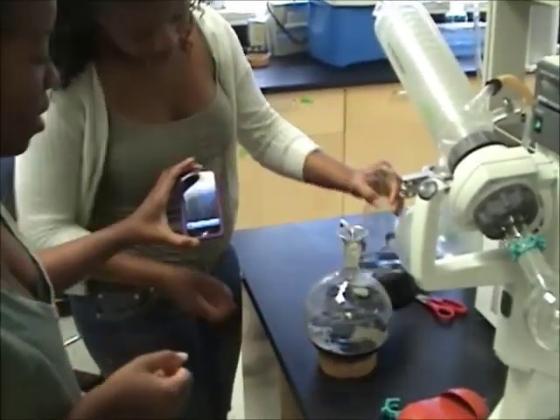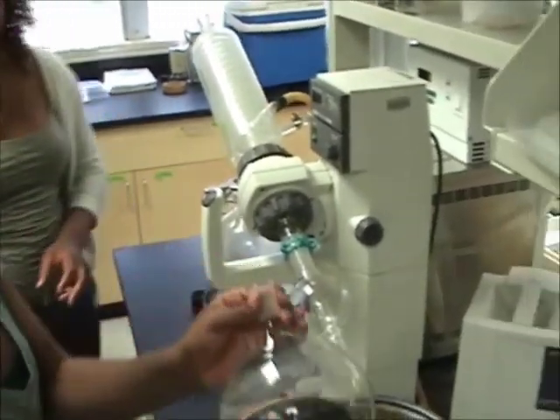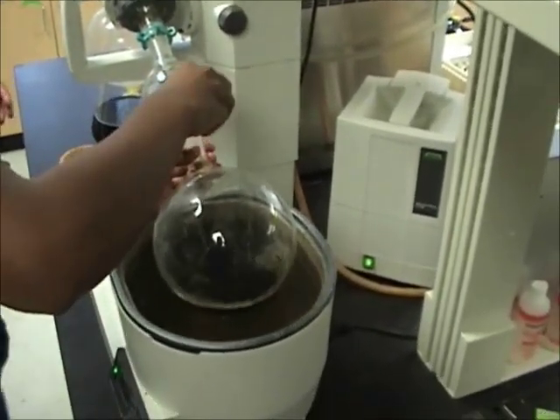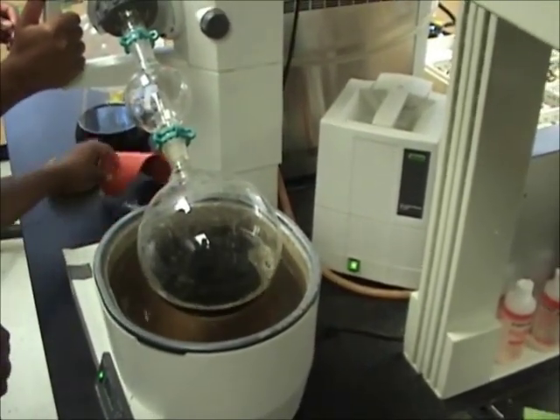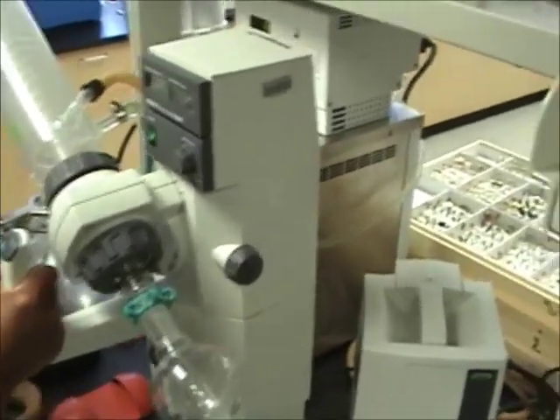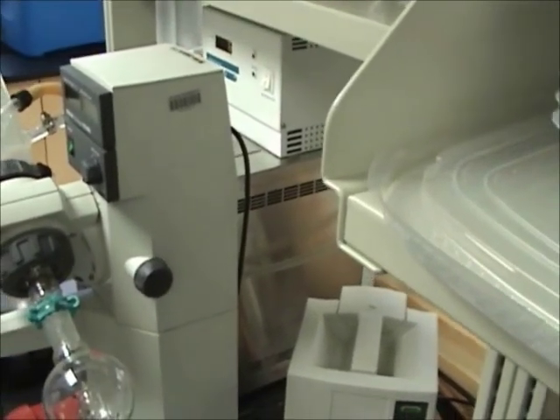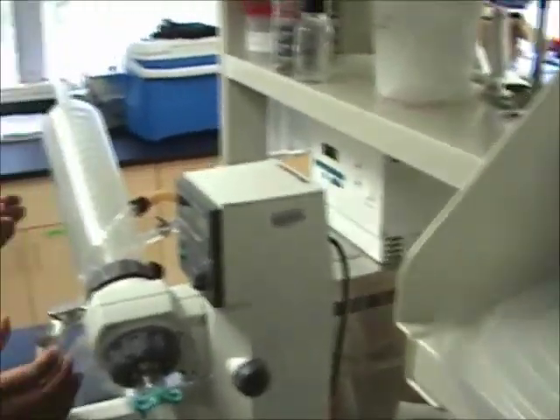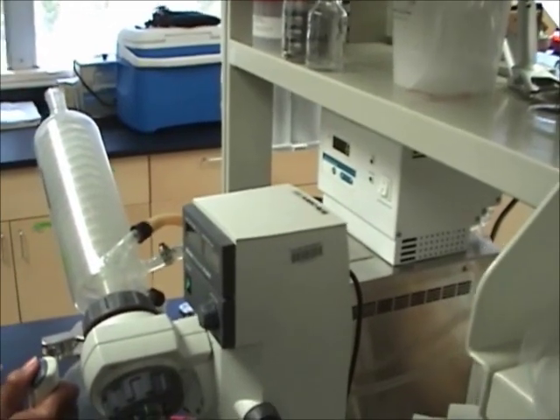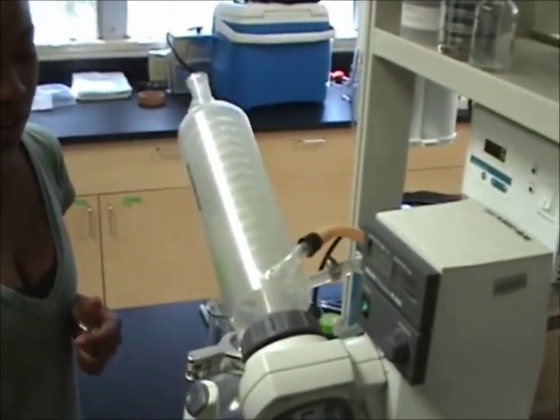What she's pouring in is the non-purified solution. This device creates the vacuum — once we plug it in, that increases the vacuum. The coil keeps it pure: the water in the coil is cool, so when the gas comes up it can condense and collect. This is just a water bath down here heating the fluid — hot water.